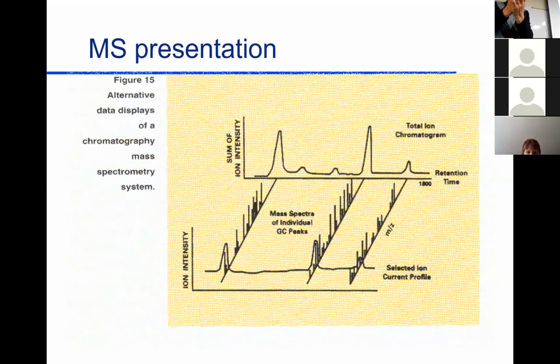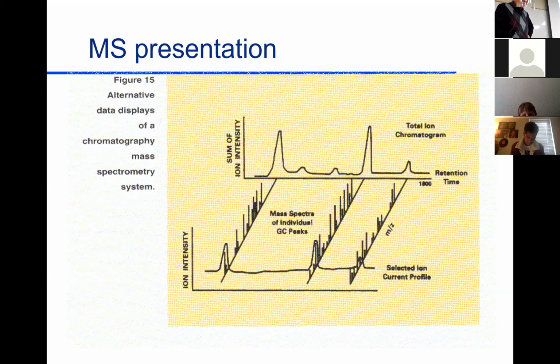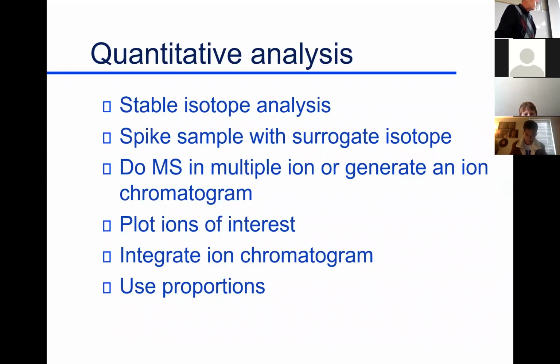It's taking samples, blowing them into bits, measuring, blowing them into bits, measuring. They can do that many times a second, hundreds, maybe 1,000 times per second. And so the whole time that it's drawing this line, it's getting separate mass spectra over each of those peaks. And so that's the image that's shown here. We've got different spectra coming across as a function of time of your LC or your GC. In the end, you'll take these individual spectra, the profiles, and do the computer searching on those. The computer will try to match fragments to some known compounds and tell you what that compound is.